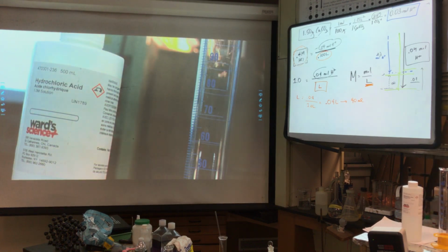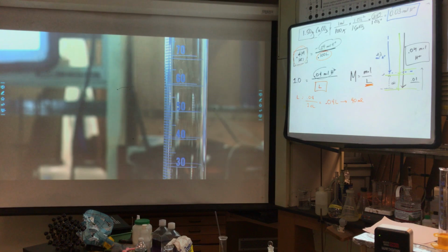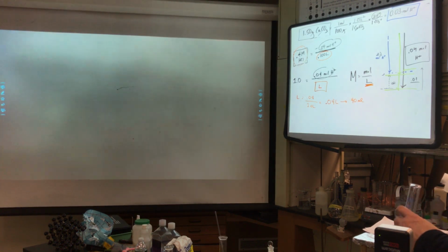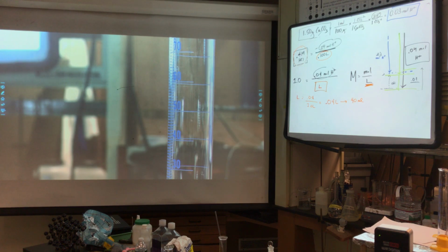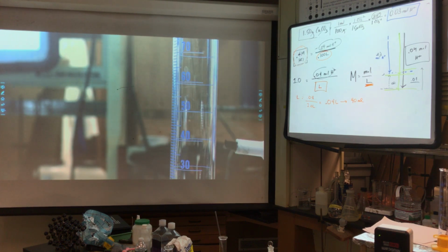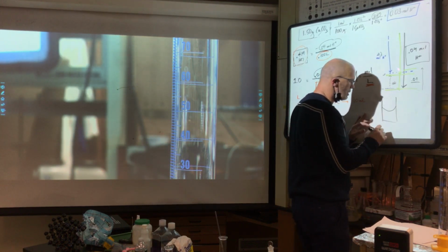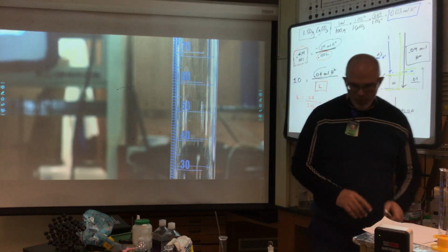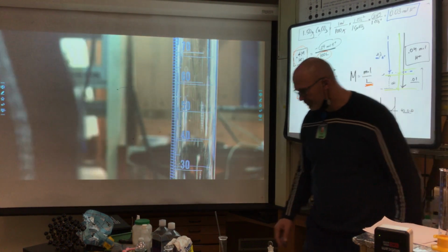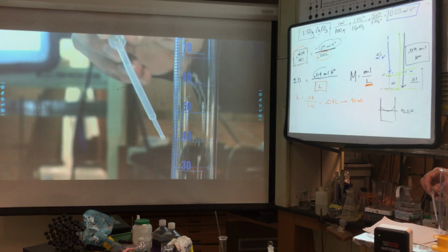Now you see 50, but what I would do, party people, is add the stock solution and pour it into my graduated cylinder till it exactly hits the 40 milliliter mark. In fact, the meniscus will just touch the 40 milliliter mark. The meniscus, due to surface tension of the water, the adhesion and cohesion, will hit perfectly at the 40.0 milliliter mark. And if I pour too much or too little, I'll adjust that value with a pipette so it's perfectly on the line.